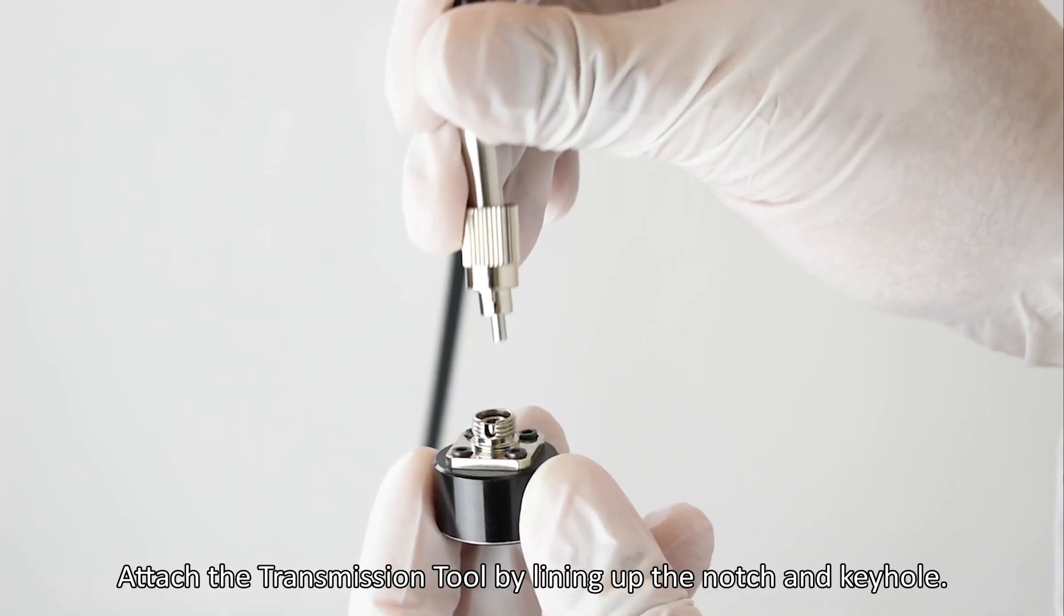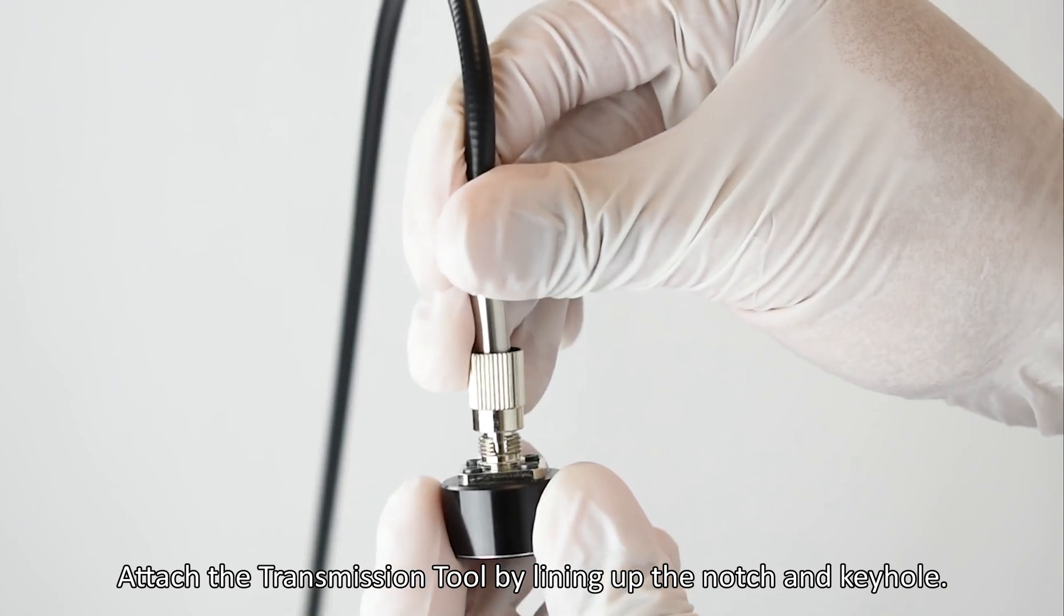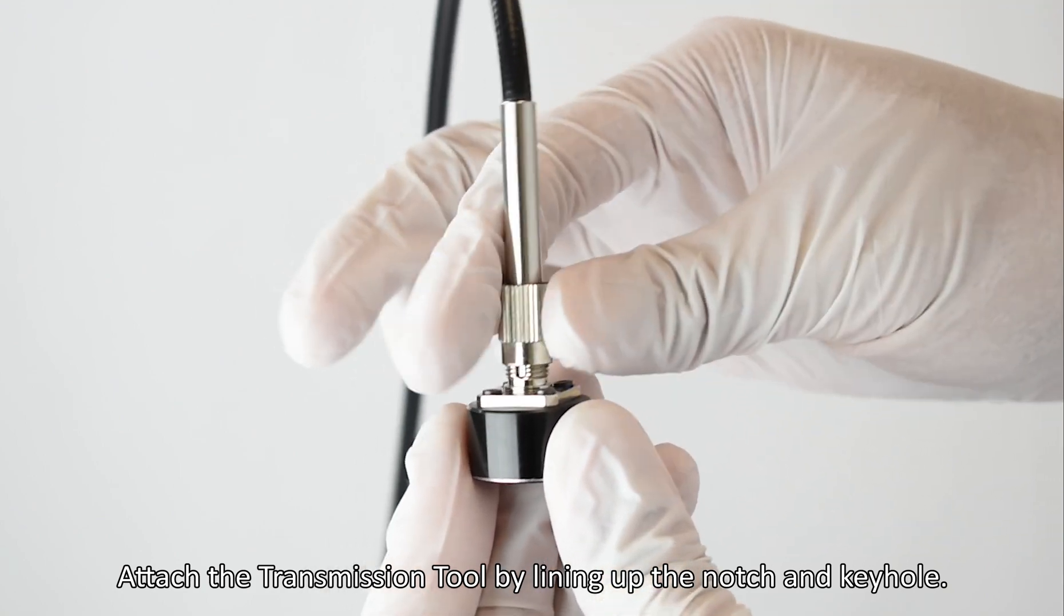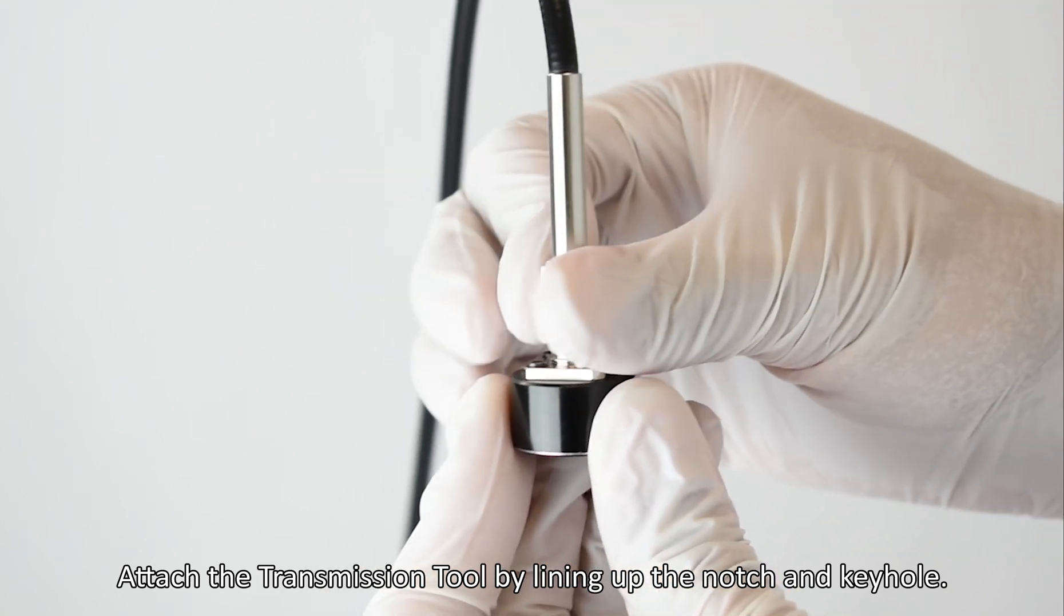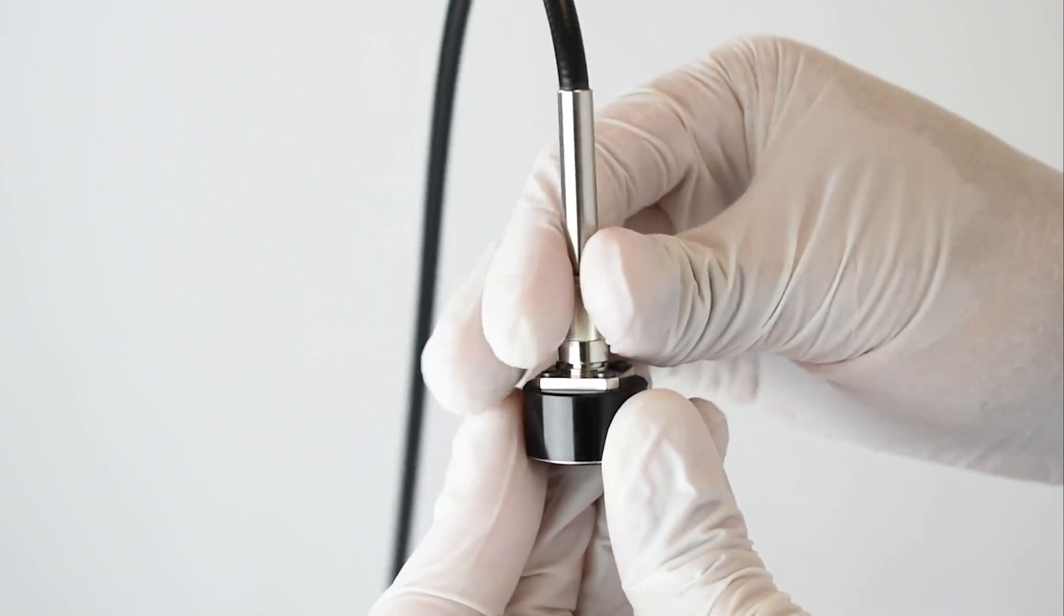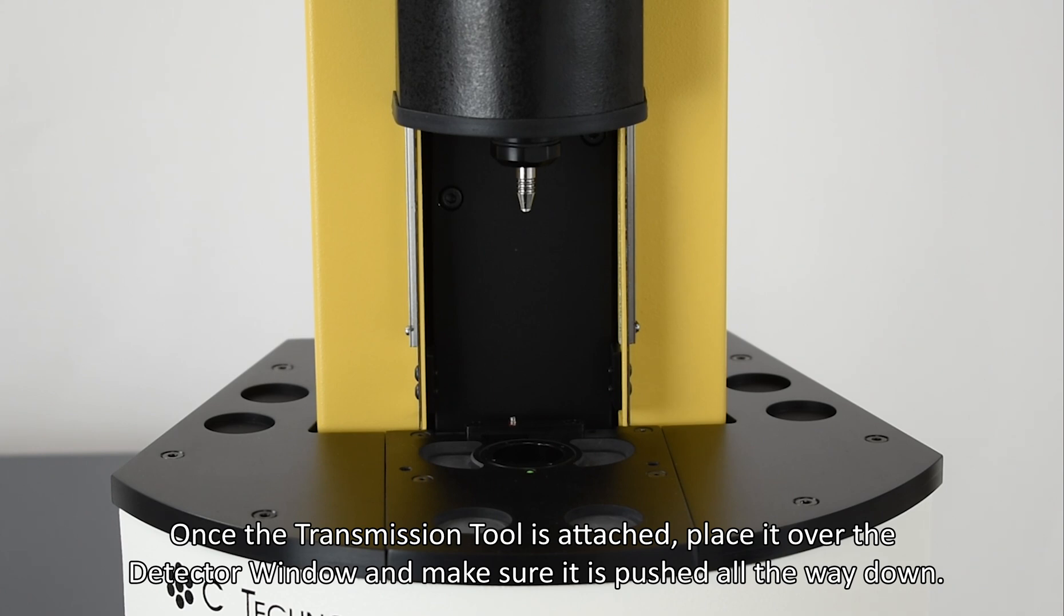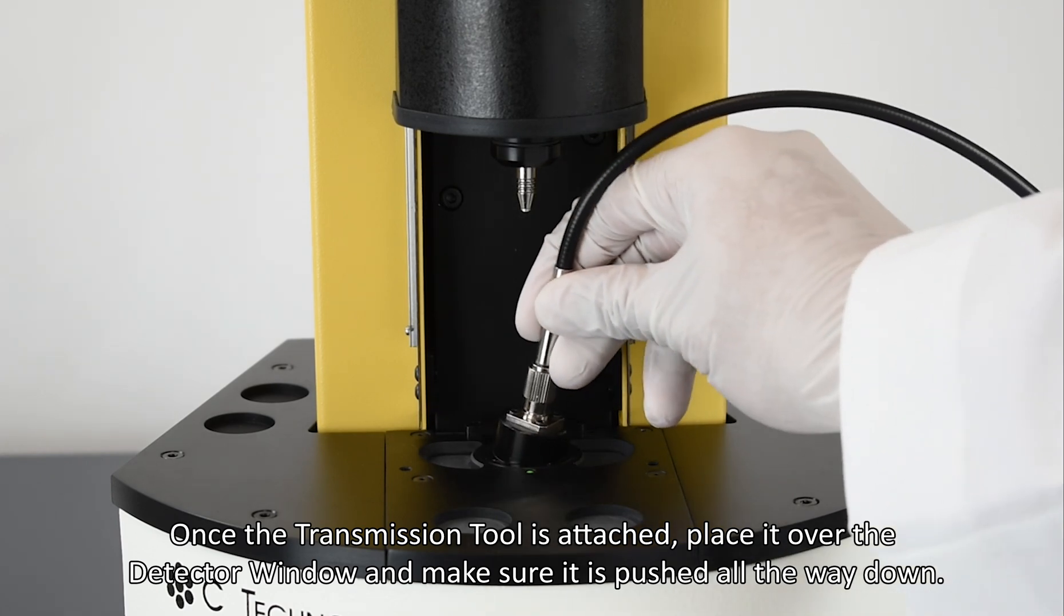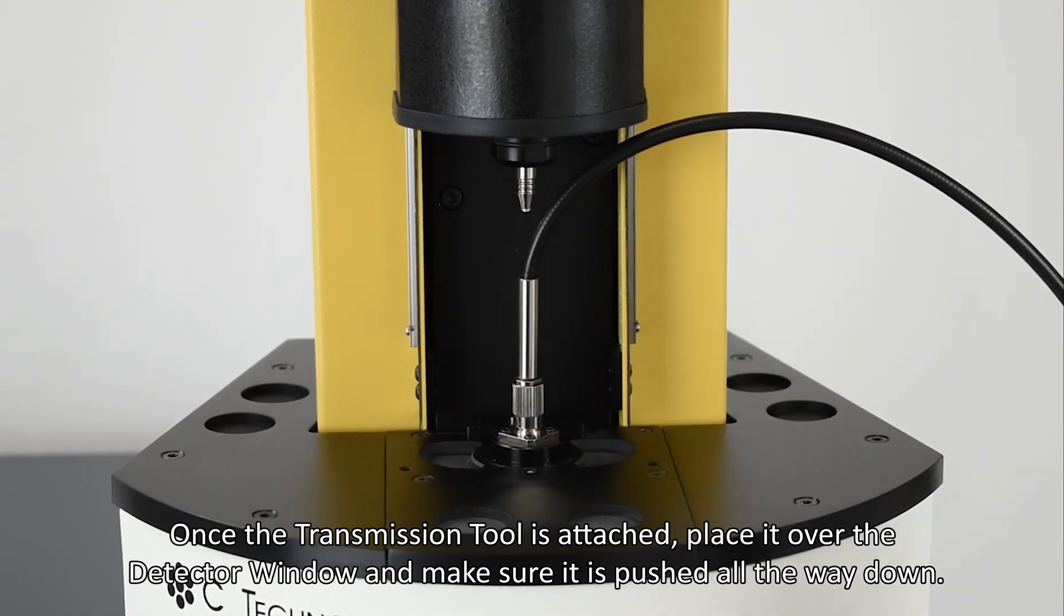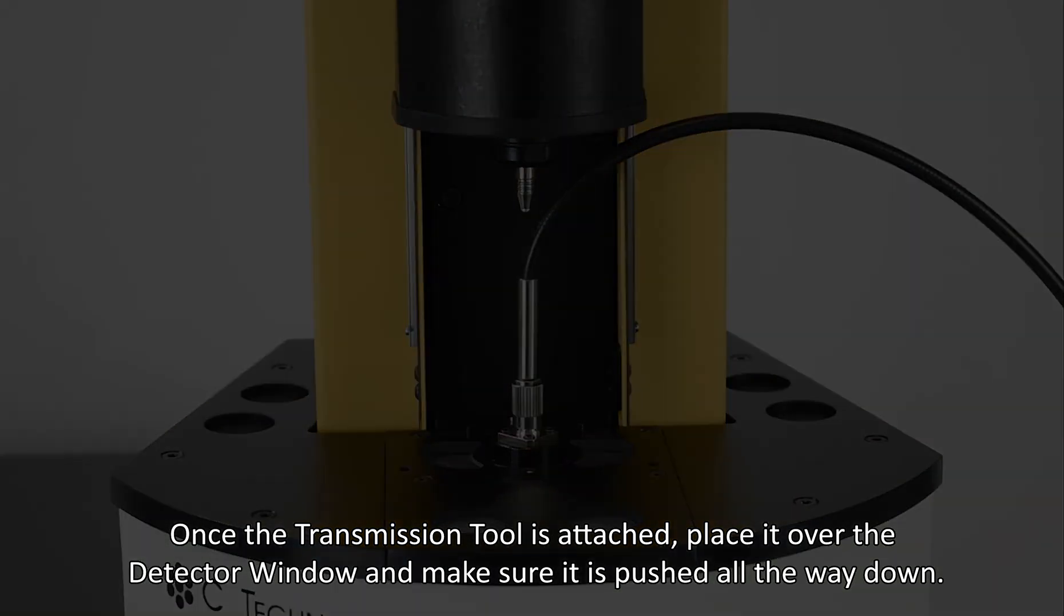Attach the transmission tool by lining up the notch and keyhole. Once the transmission tool is attached, place it over the detector window and make sure it is pushed all the way down.